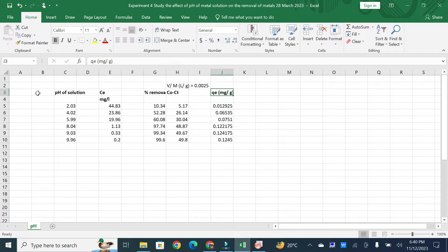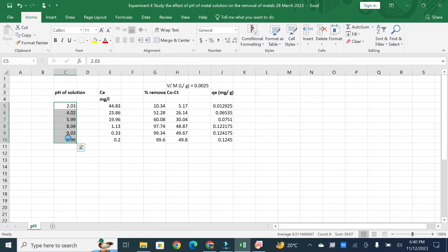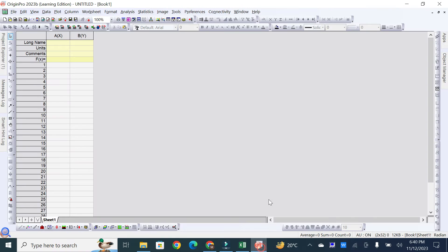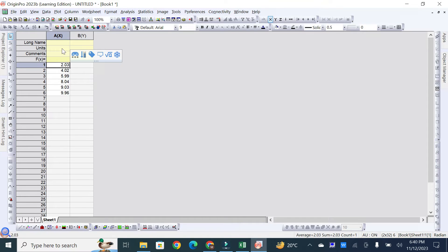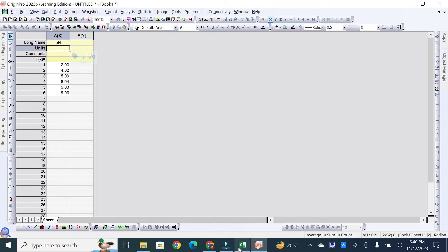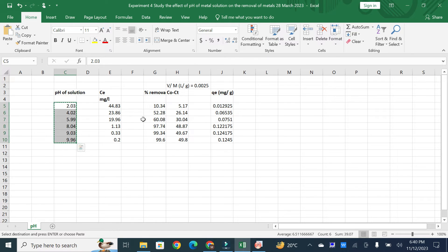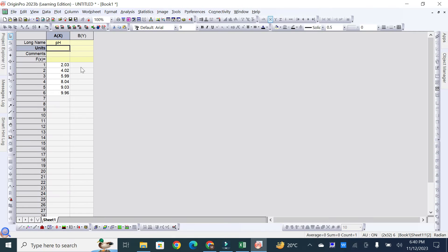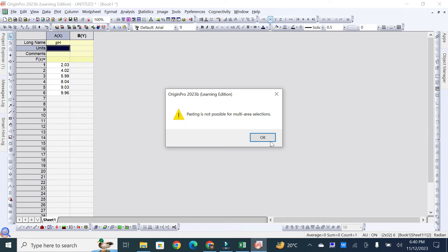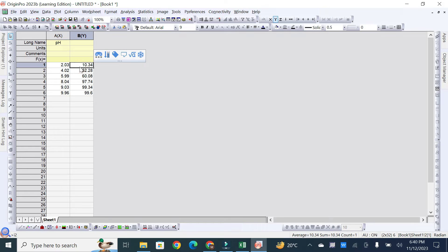For example, if I want to put data on the X-axis, I can copy it from an Excel sheet, go to Origin, paste it there, and rename the axis title. For example, if it is pH, I can rename it as pH. For the first Y-axis as percentage removal, I can copy and paste those values and rename this axis as percentage removal.